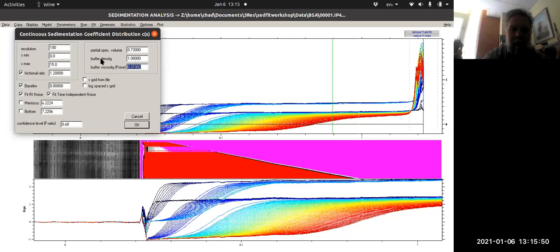So these are buffer parameters. You can actually calculate them from sedinterp. I have a couple of pieces of equipment that let you measure them if you want to. Generally speaking, unless you're adding weird stuff to your buffer, these defaults are going to be really close to correct. This is the viscosity for room temperature solution, 20, 24 degrees, it'll be about the same. The buffer density, if you look up the numbers, you're just changing things in the second or third significant figure. So it's not really changing much. You can actually play around with that, with setting different values and seeing if that changes your model.